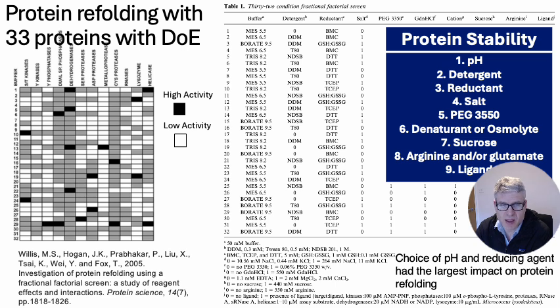You do need to do a big screen, and there are some refolding kits out there, but with a good understanding of DoE from this talk and the spreadsheets, you should be able to put these together yourself as well.